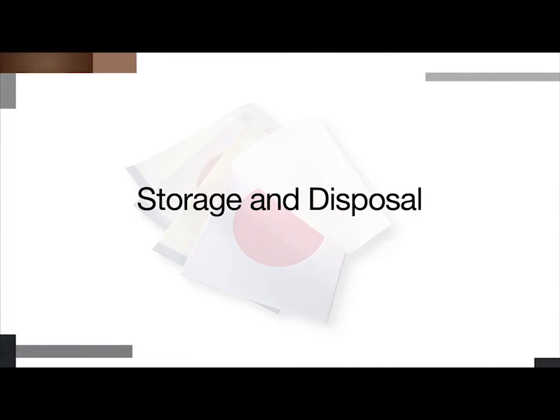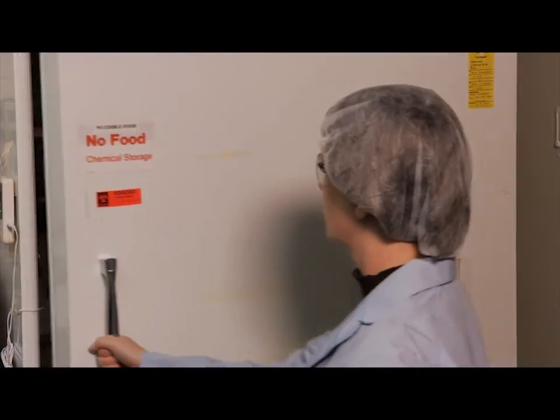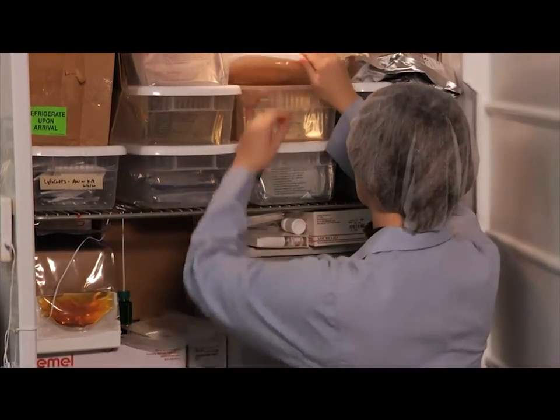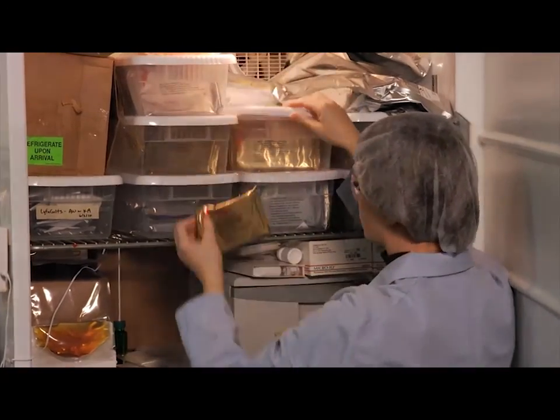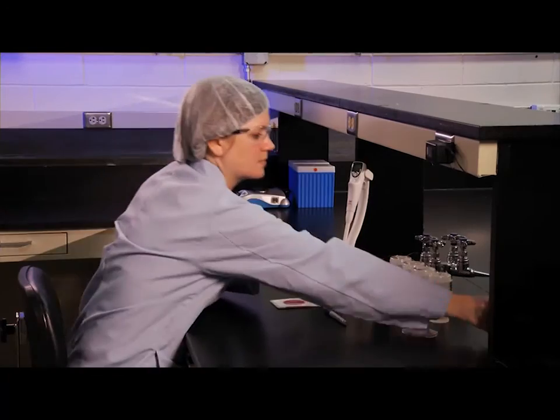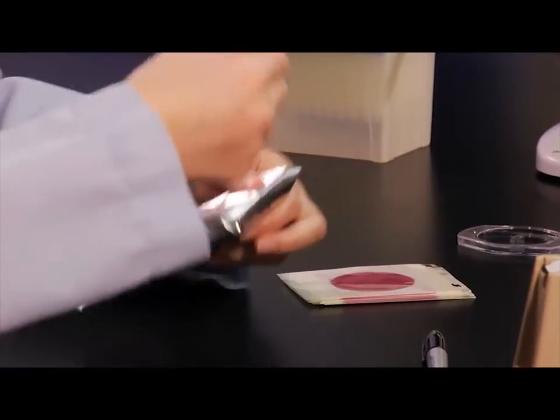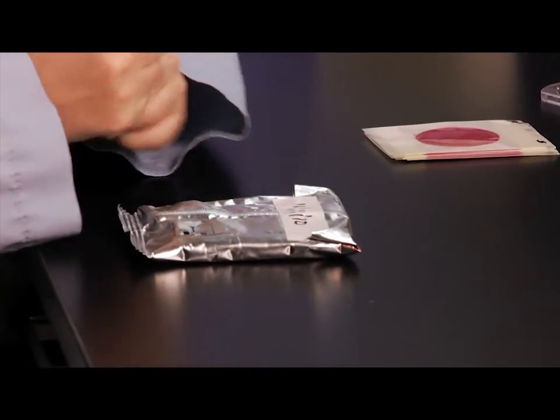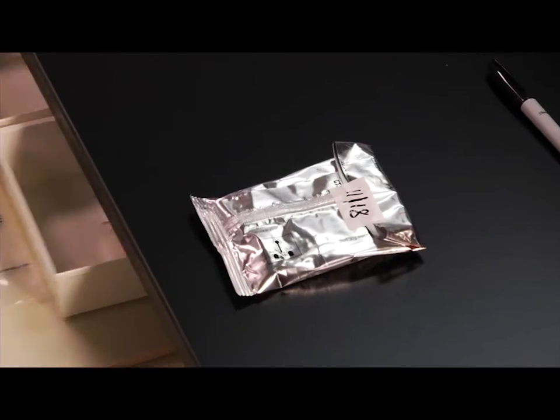3M Petrifilm plates are easy to use and require limited space and disposal. Refrigerate or freeze unopened packages upon receipt and use them before the expiration date on the package. Seal open packages by folding the end over and taping it shut. Do not refrigerate the package once it's open. Simply keep in a cool dry place and use it within one month after it's been opened.